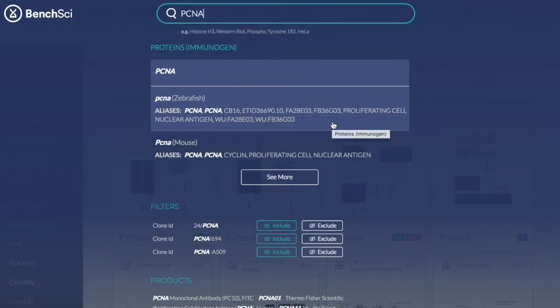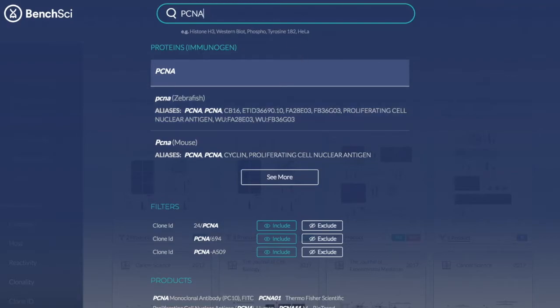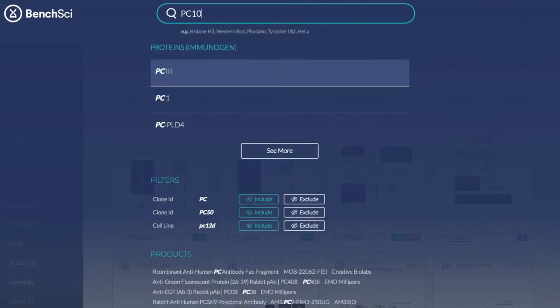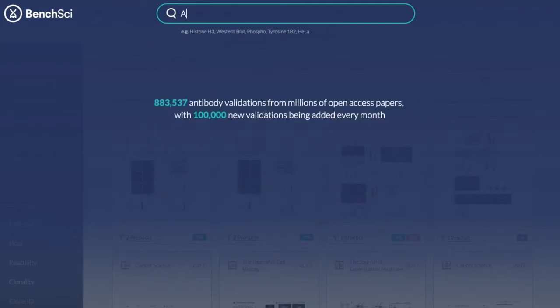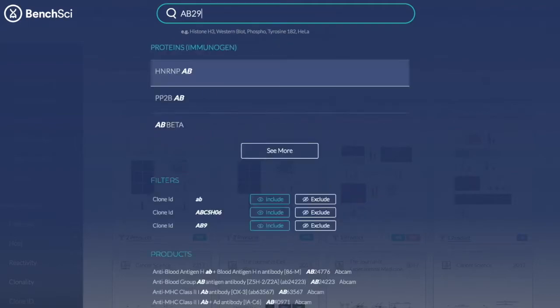BenchSci has also created a proprietary database of all known aliases for each protein and gene, so you'll be able to view all relevant data in a single search irrespective of how that protein is cited. You also have the option of searching by clone ID such as PC10 for PCNA, or by the catalog number of a specific antibody product.